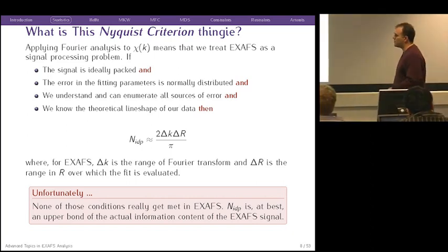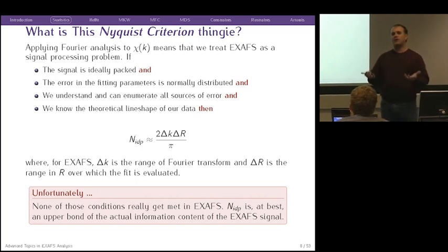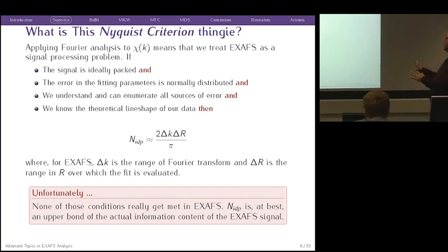So we first have to understand what this Nyquist criterion is and what it means. What I gave you before was the formula, but what are the conceptual underpinnings behind that formula? Well, that formula applies if the following are all true.